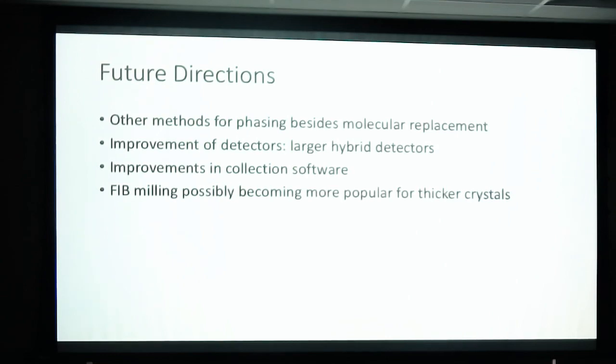There's going to be improvements in collection software. It's improving everywhere, so it's going to improve there if more people do it. And it's possible FIB milling will become more popular for thicker crystals, but if it's too big for that, maybe you want to really think about whether you can do another technique.